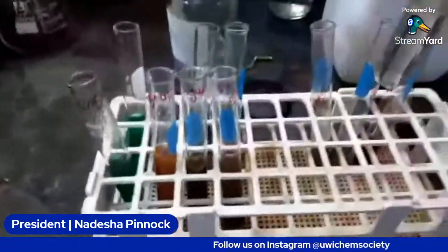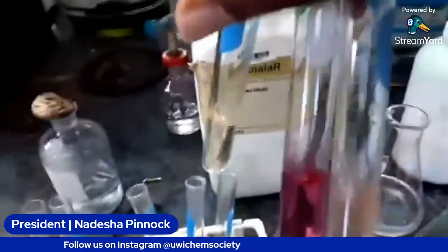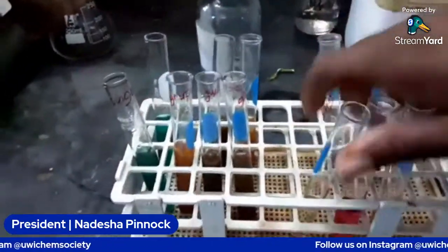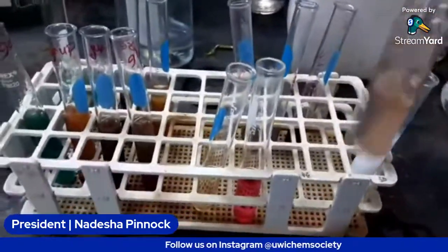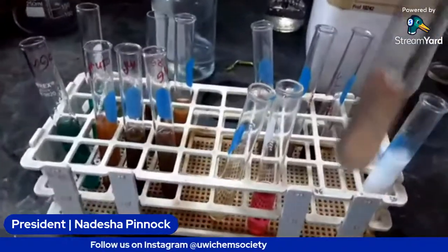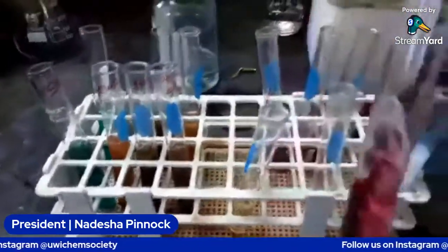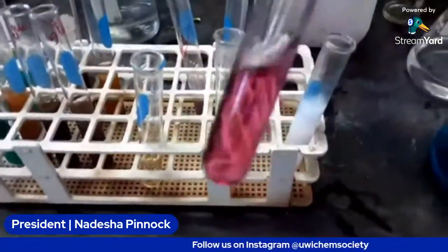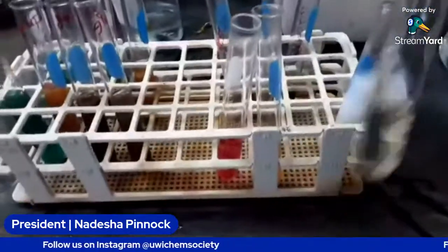So here we have the acid added to our 3 test tubes. We're going to just stir it so that the acid can combine throughout the whole mixture that we have. That's the syrup, and this is the sucrose.